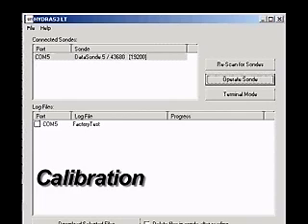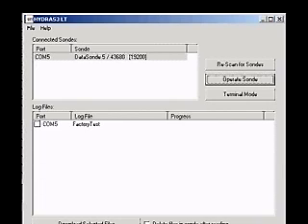Calibration. Establish a connection to the sonde with Hydrus 3LT. Click the button labeled Operate Sonde.